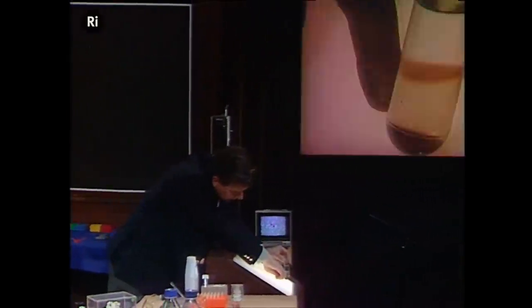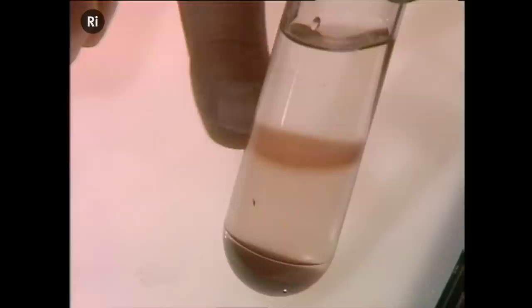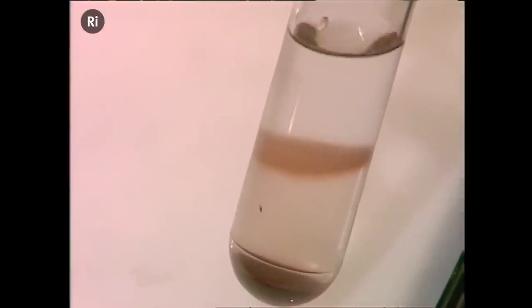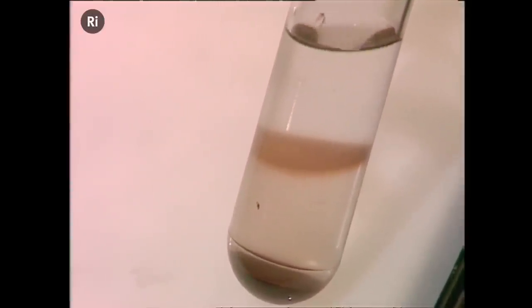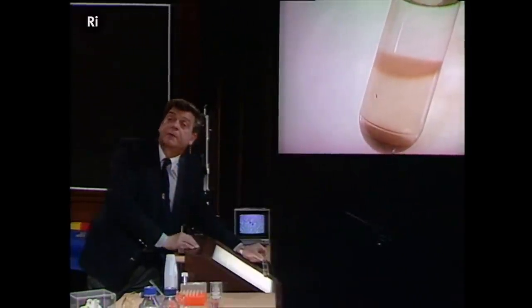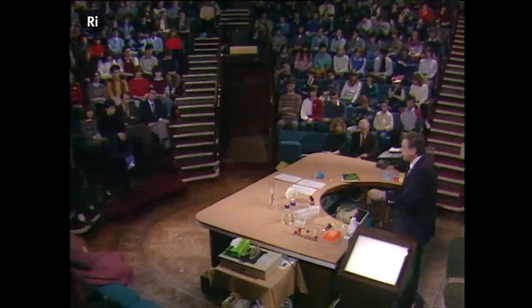The red cells all at the bottom, the clear remainder of the blood there, and there's our layer in the middle of the lymphocytes. Just like we showed you in that model experiment. So that's how we can separate the lymphocytes from the rest of the blood and recover them to work with to establish what their types are.